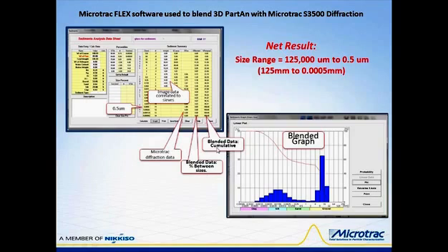Now, often it's desirable to present information in graphs because it provides such a visual impact. So another tab exists right next to the Calculate tab, and you can actually see that one slightly highlighted. This is called the graph, and once the graph is clicked, then the display at the right is shown, and this shows the blended data.